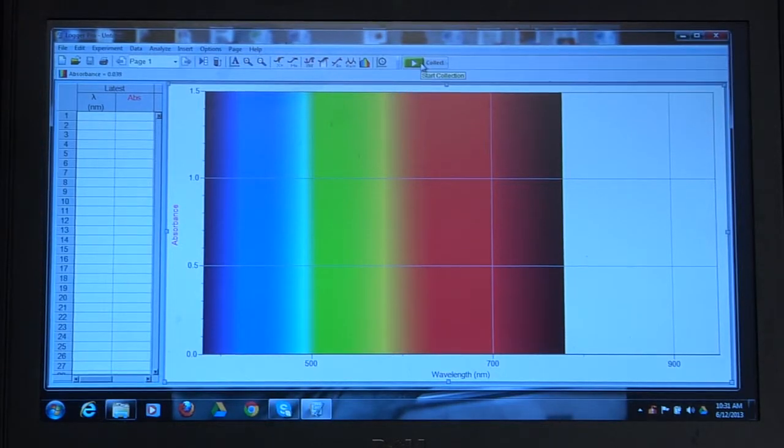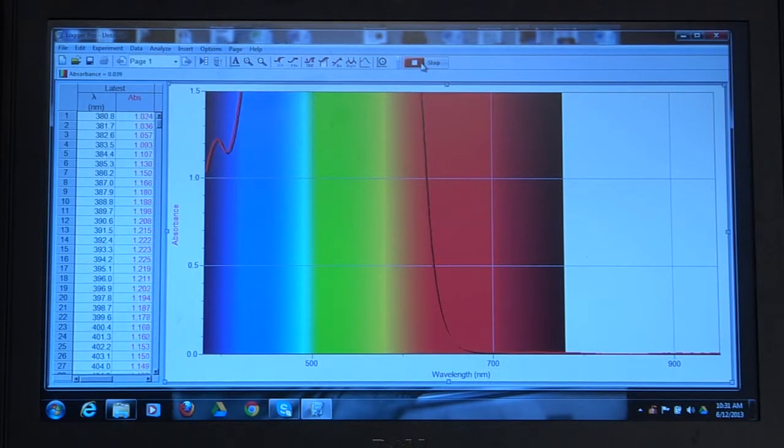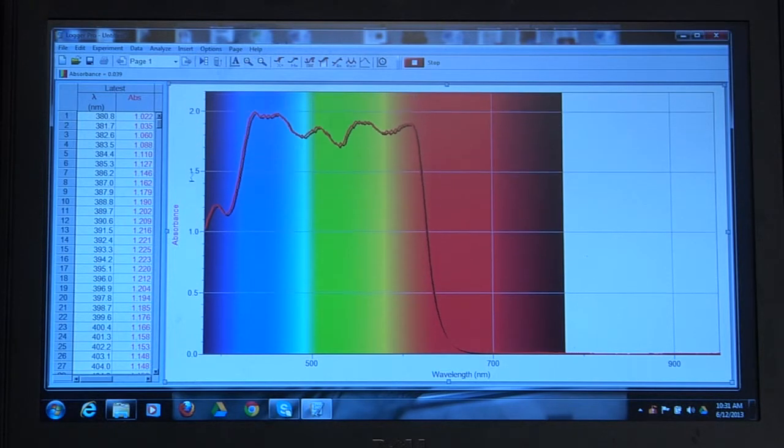Now that we have our sample in our spectrophotometer, we can collect the data. And so what the spectrophotometer is doing is it's running a scan for each wavelength.